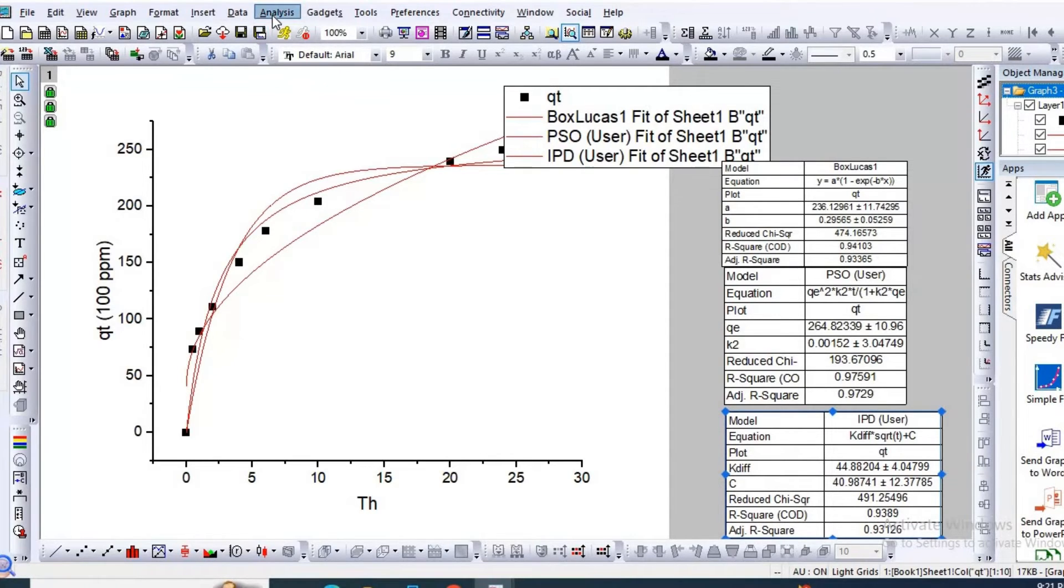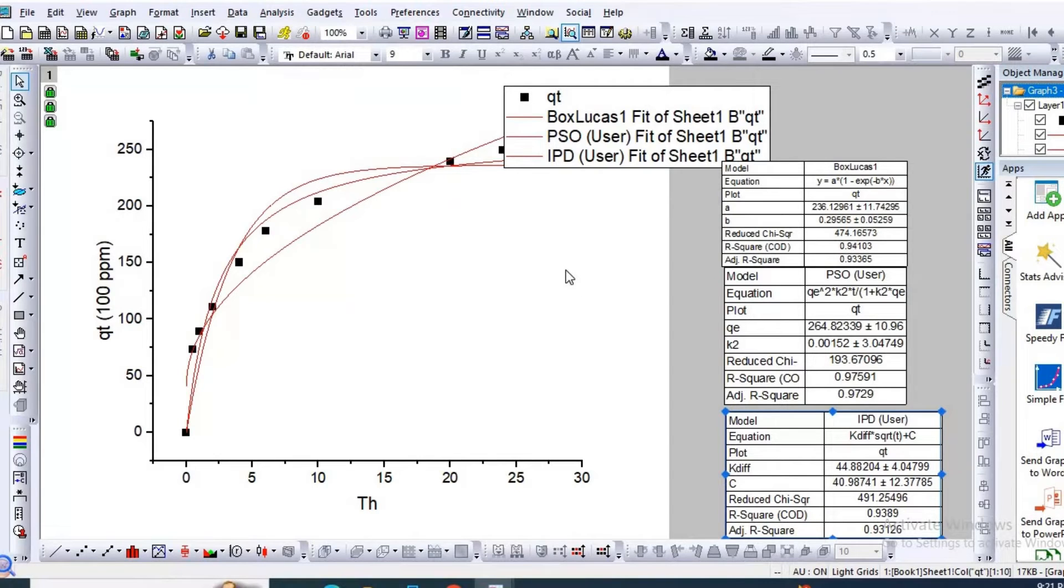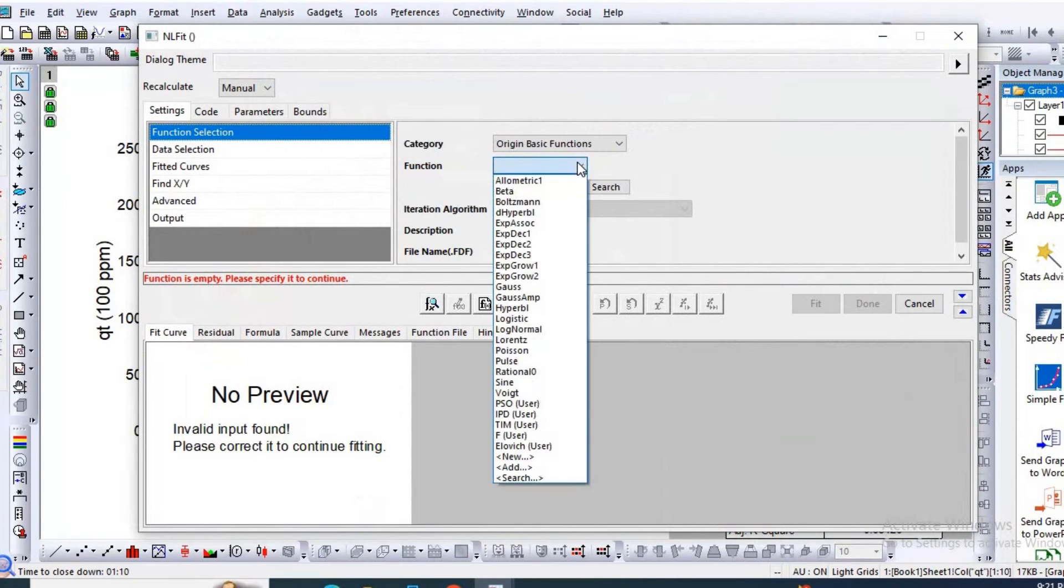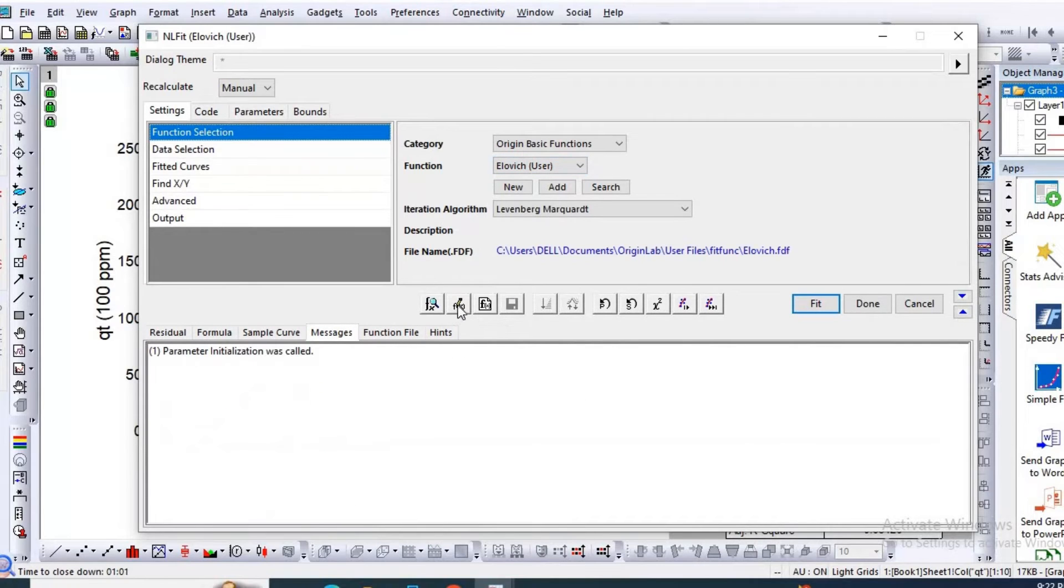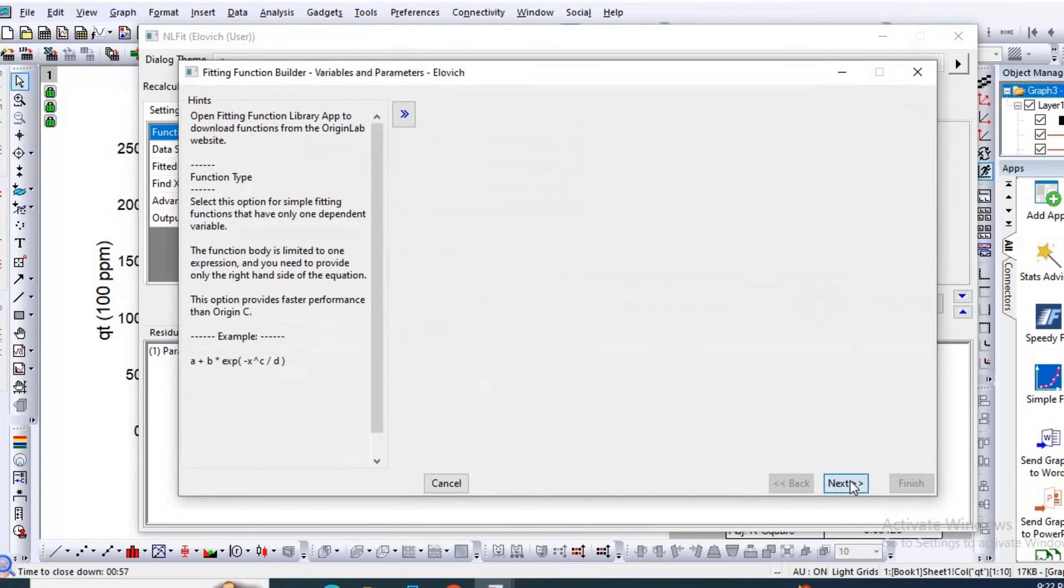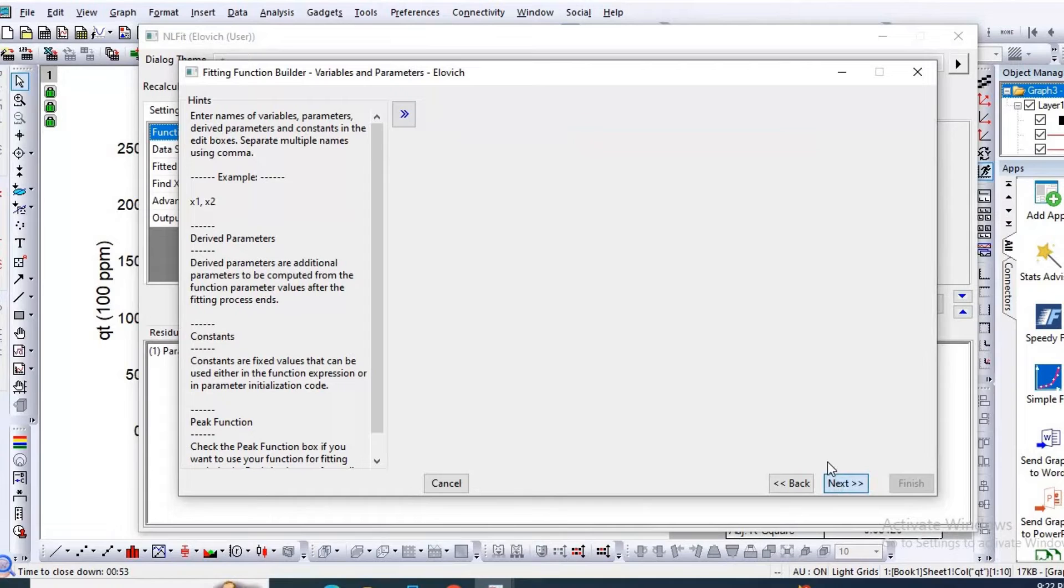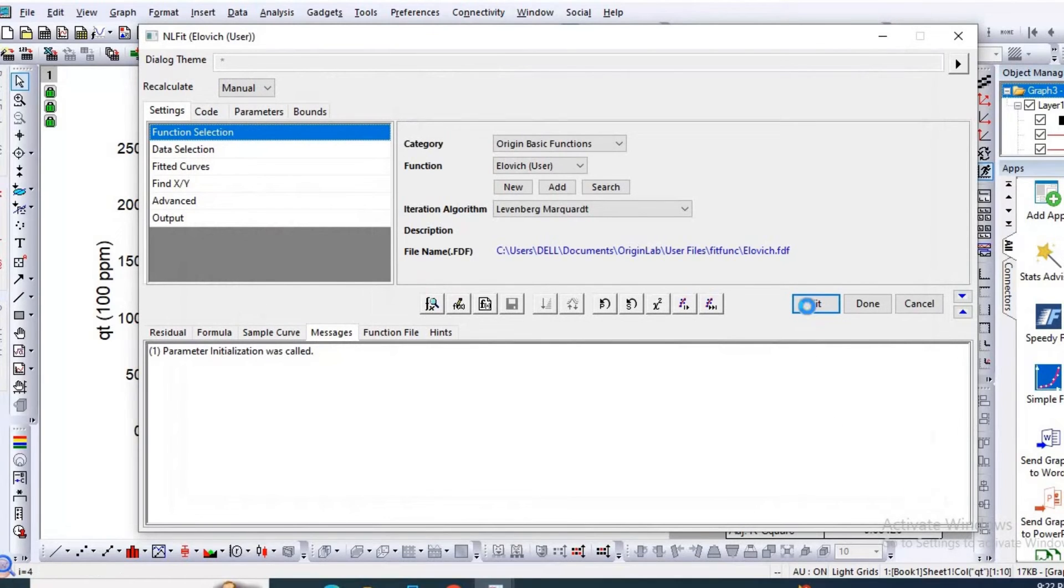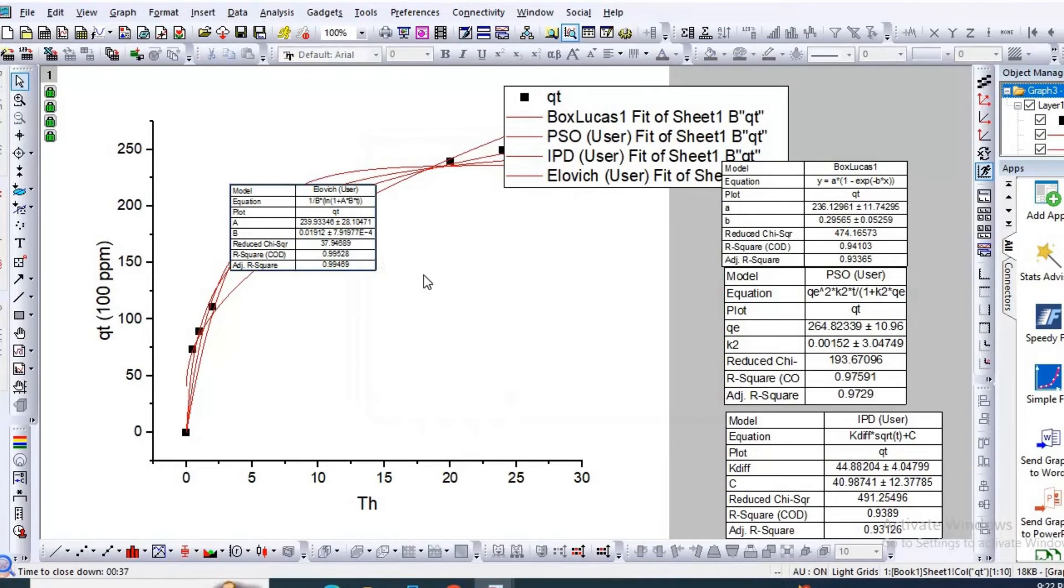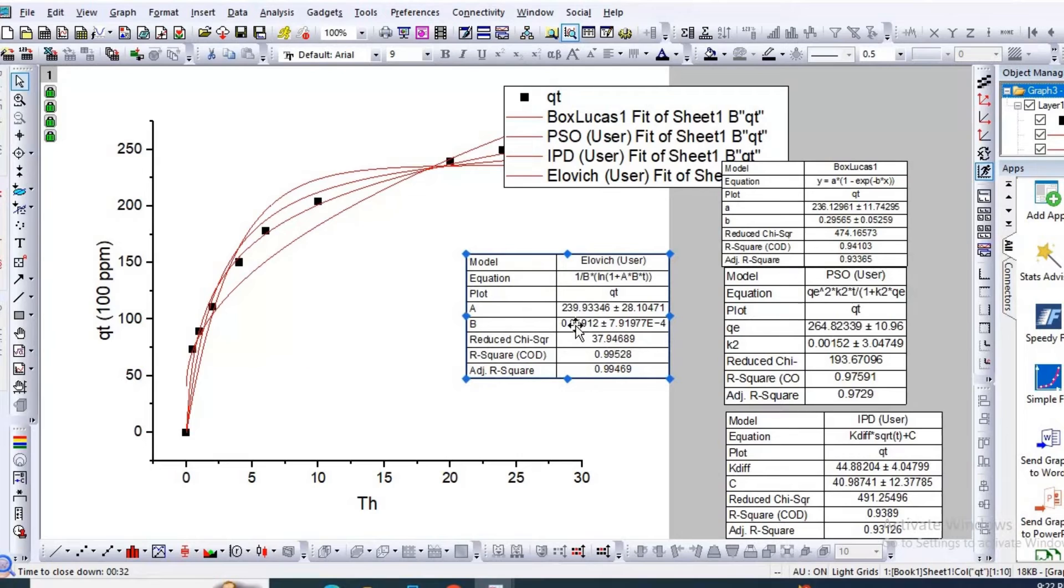Finally, go to Nonlinear Curve Fitting for Elovich kinetic model. I have previously built Elovich kinetic model. So click here. See, here is Elovich kinetic model. I have previously built the function. Let us see the function. Click here. So these are the independent variables and this is the function. Then Finish, then Fit. Then No, then OK. So here is your fourth adsorption kinetic model, Elovich model parameters.